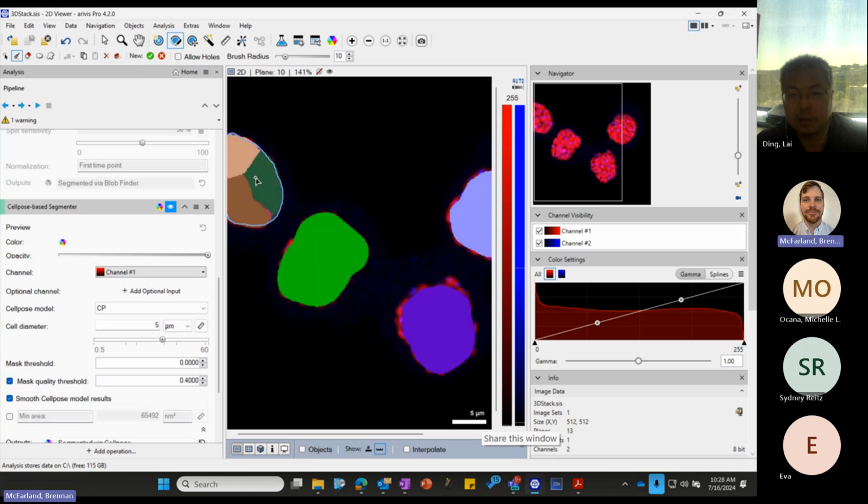You'll then correct it, and it'll retrain automatically once you place the correction in, going to whatever you manually adjusted, and then it would retrain with that in mind. So that's how you build a custom Cellpose model. But it's always best, I think, to start with these parameters the best they can be.